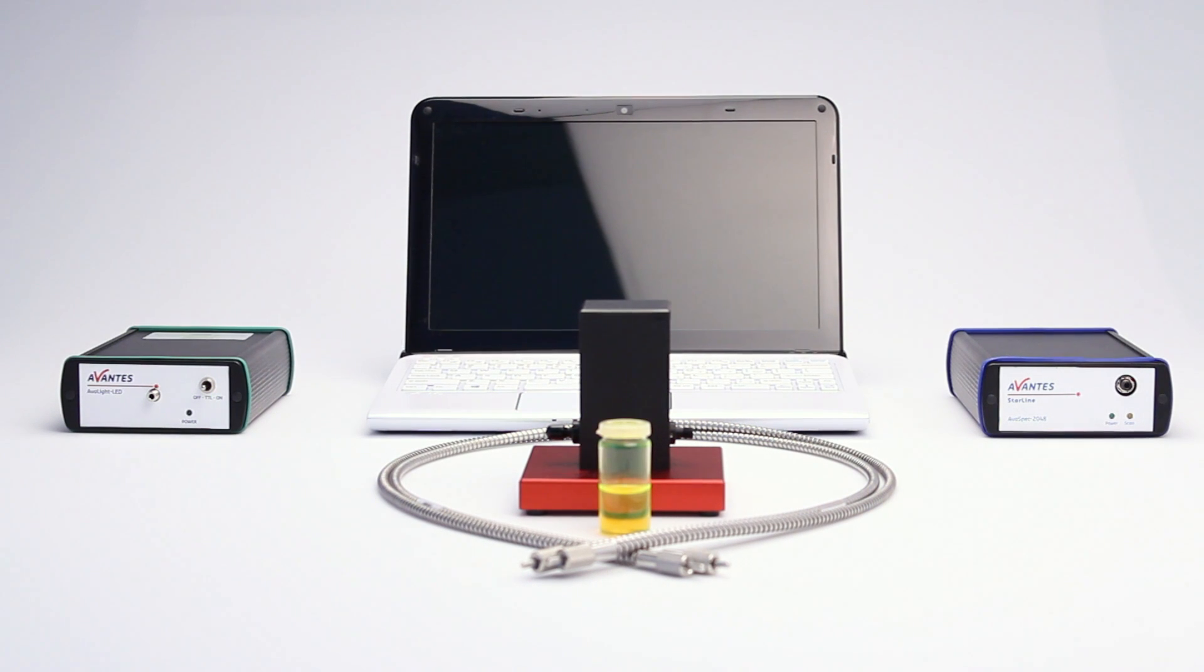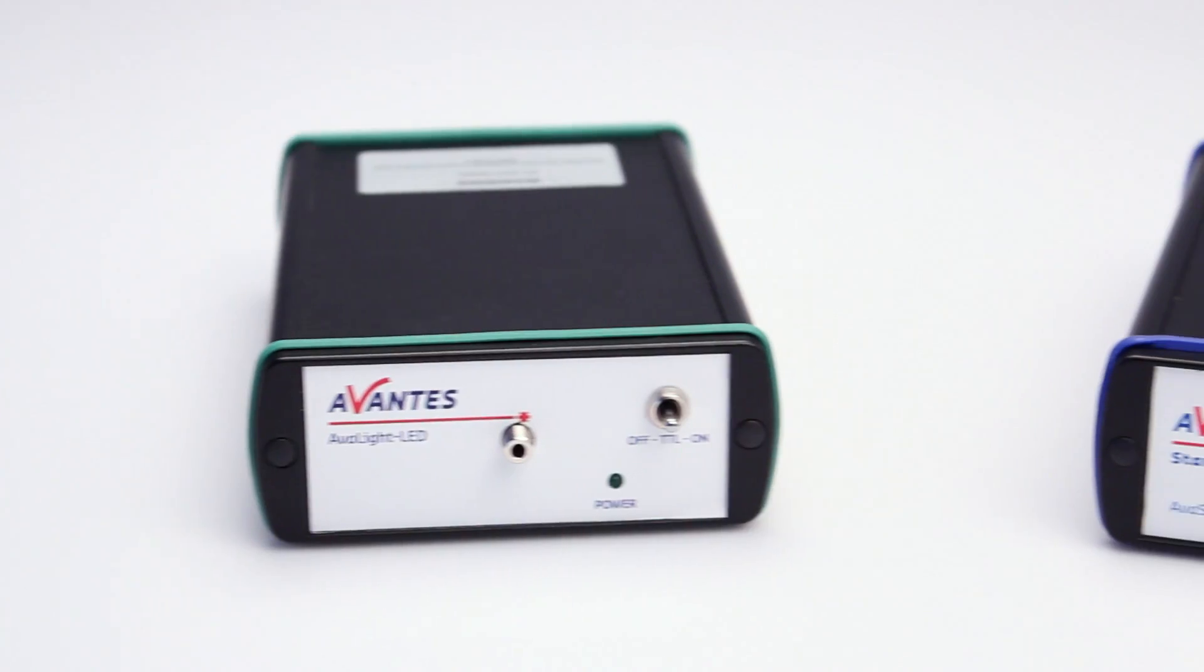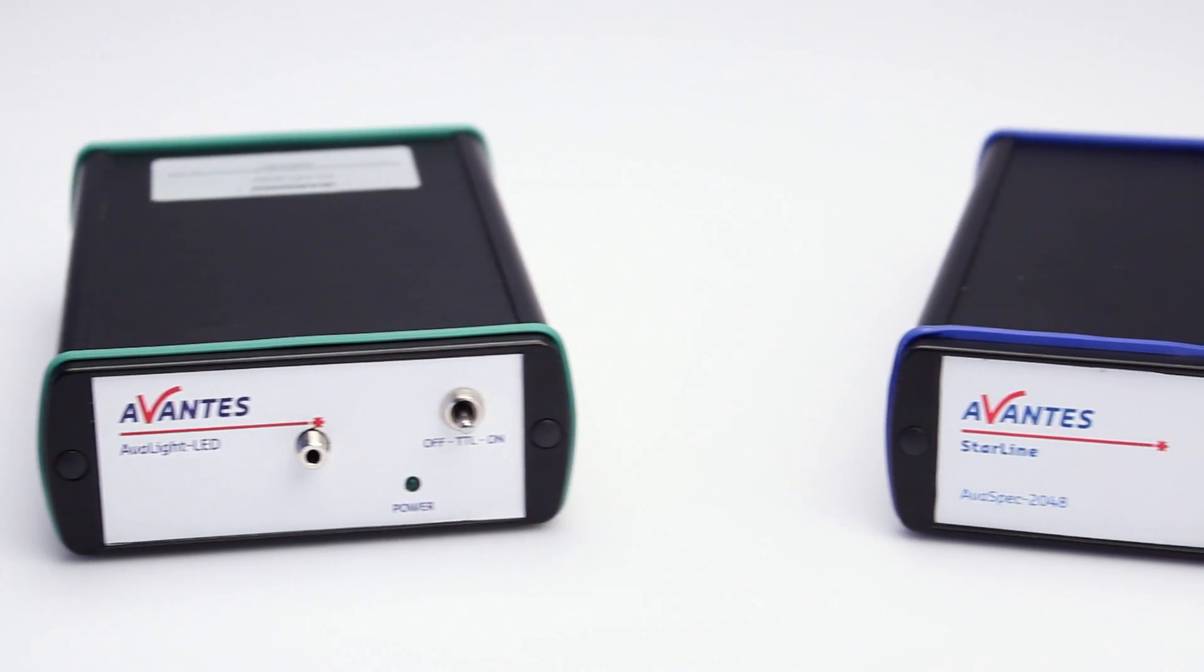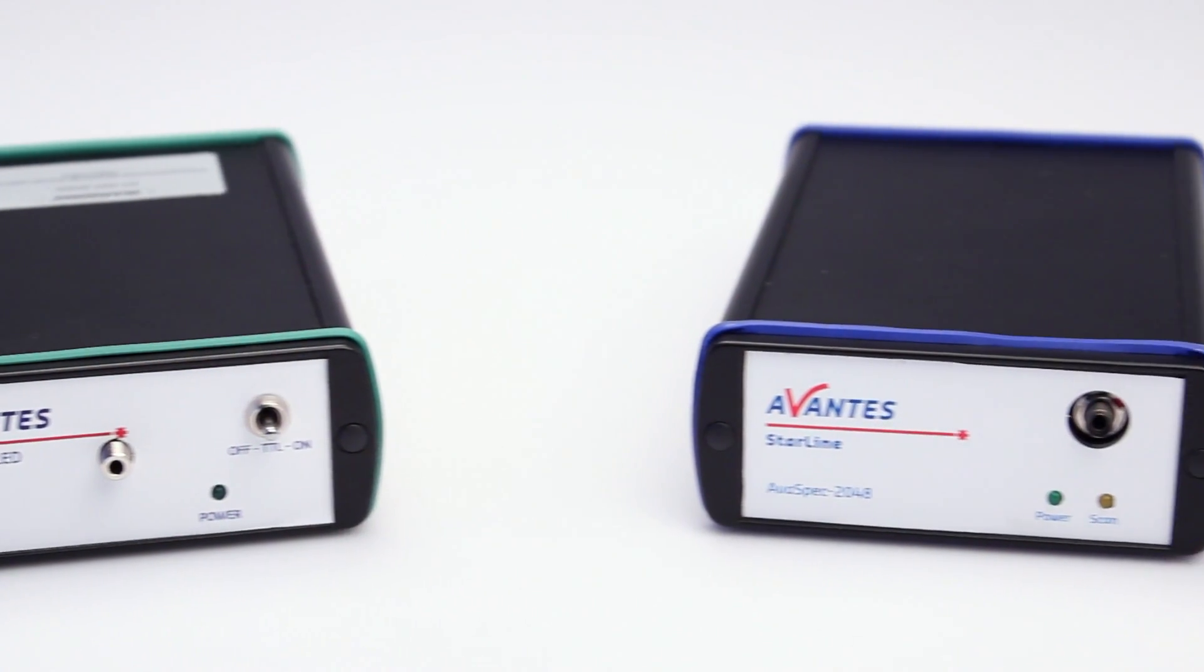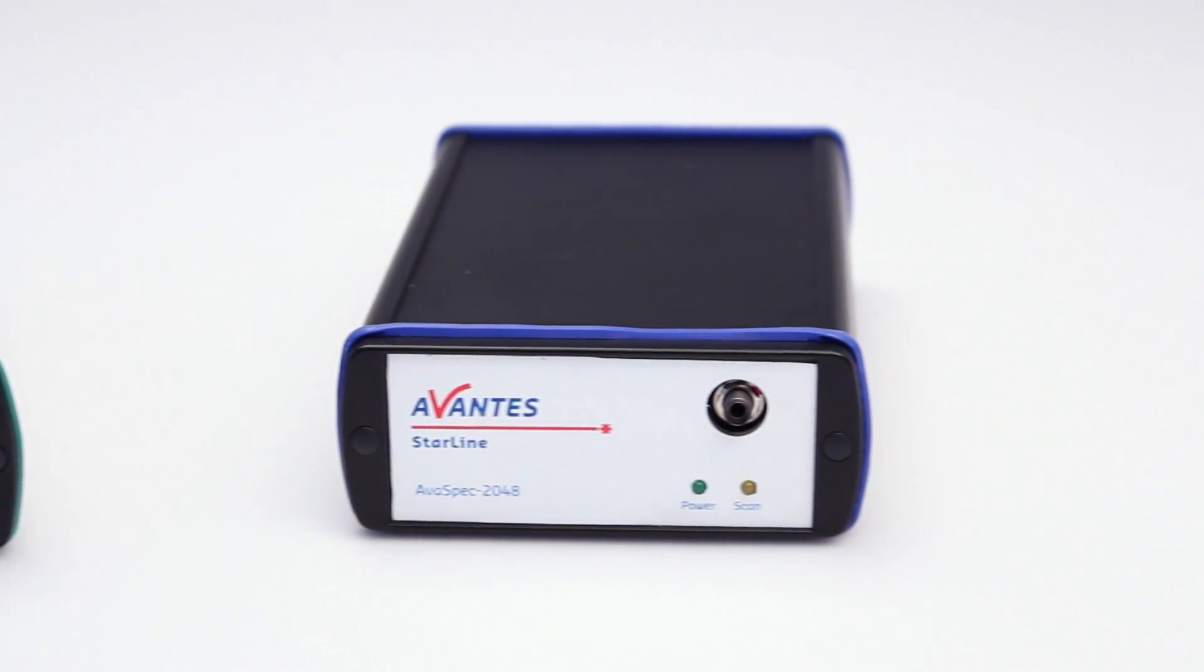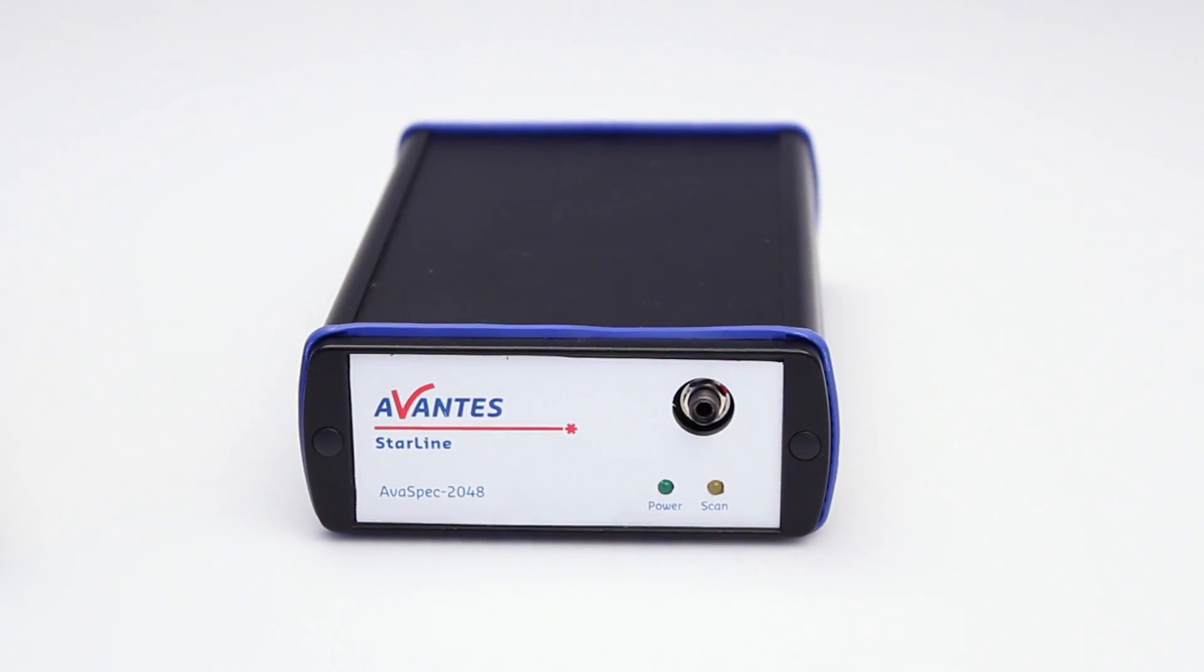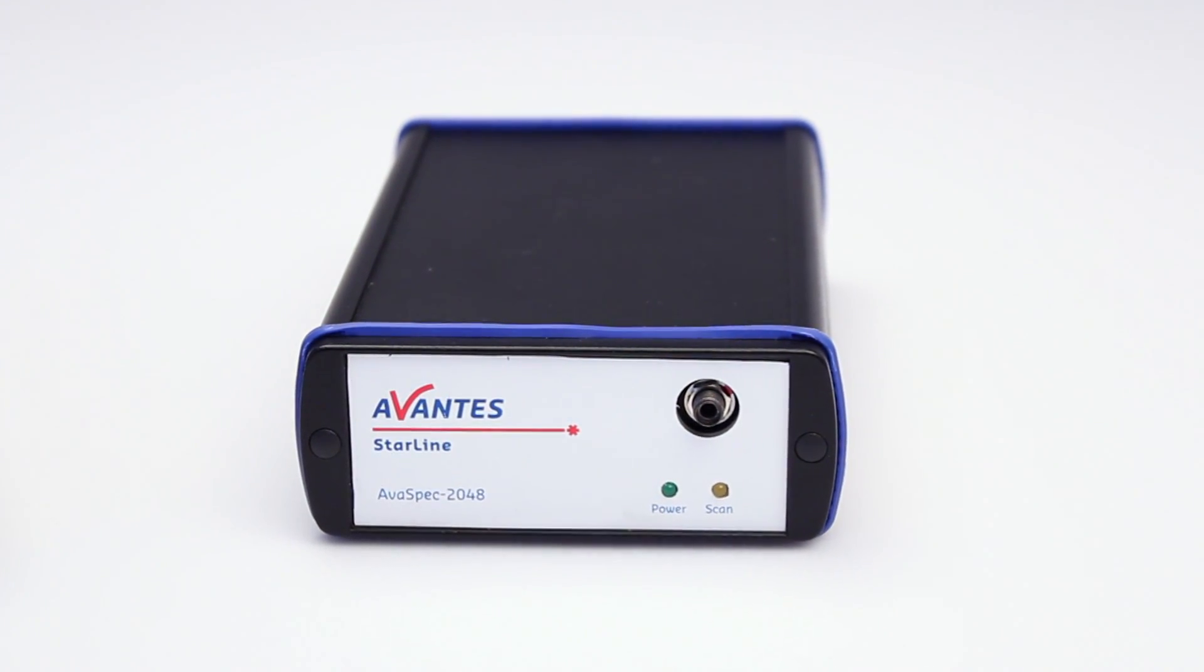In this video, Avantes is going to explain to you how to do a fluorescence measurement. Before we start, make sure you have the latest version of Avasoft installed on your computer, which can be found on the Avantes website.